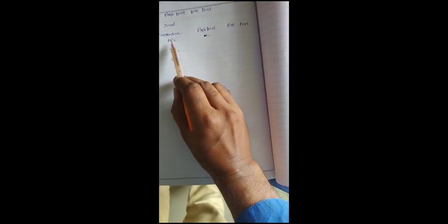You have to note the readings in this particular table. You have to identify the initial temperature. There is no flash at 32, no flash at 40, no flash at 55, no response. Then we take another reading at 58. There some flash occurs. The flash point is done.